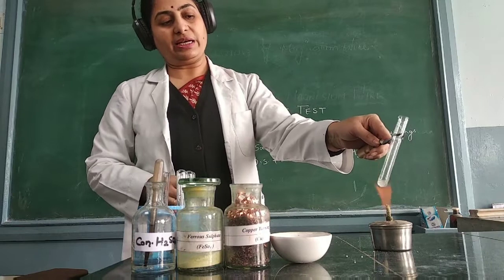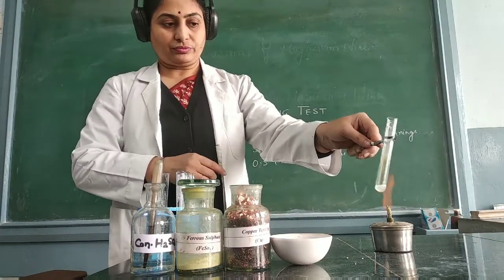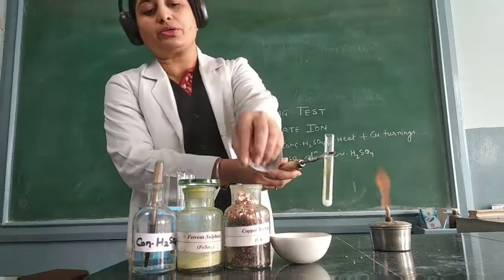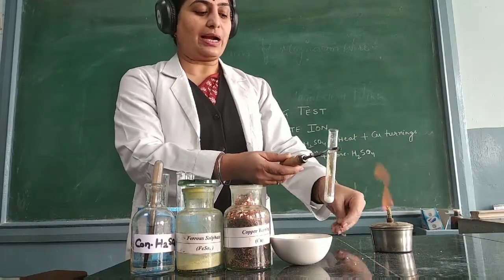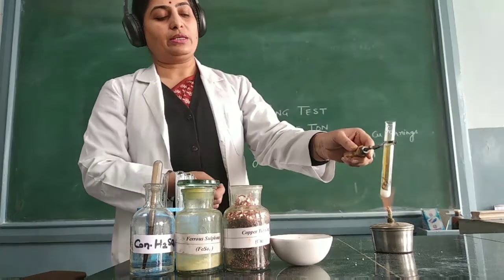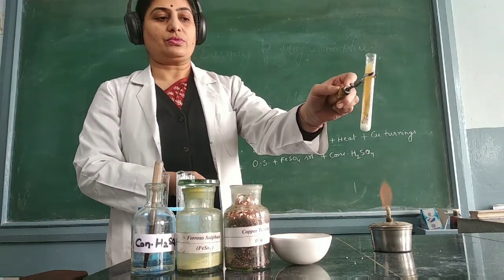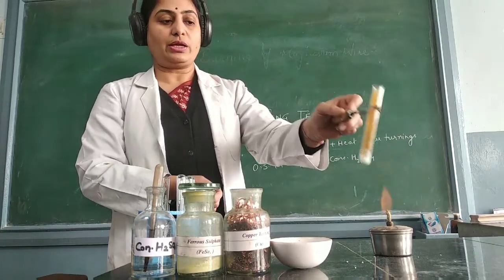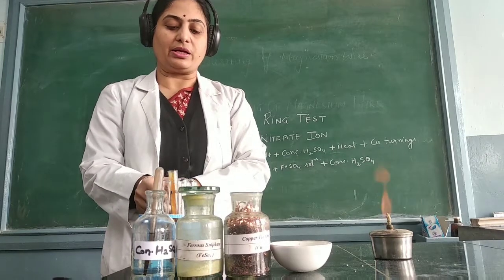If we observe any change or reaction, we can see a very light brown color gas comes out on heating. It gets dense and the brown color intensifies by adding copper turnings to it. Here I am having a small piece of copper turnings and I add it into the solution. You can see the brown color intensifies with the copper turnings. This reaction shows that we may have a nitrate ion in the test tube.